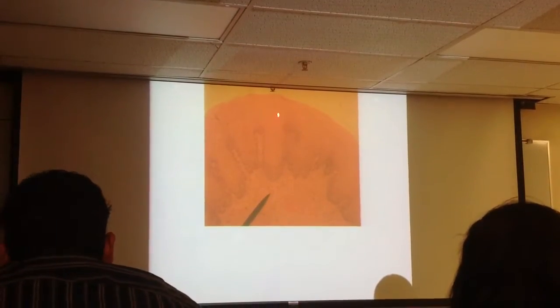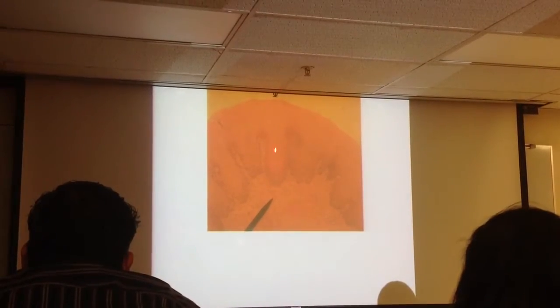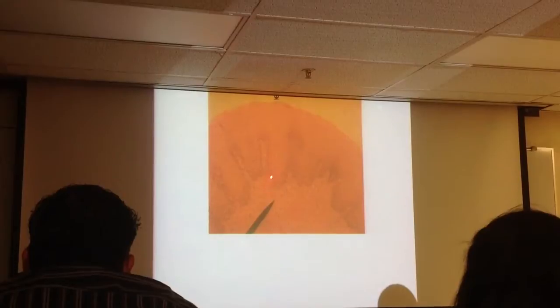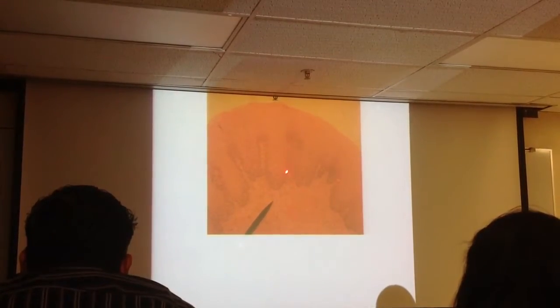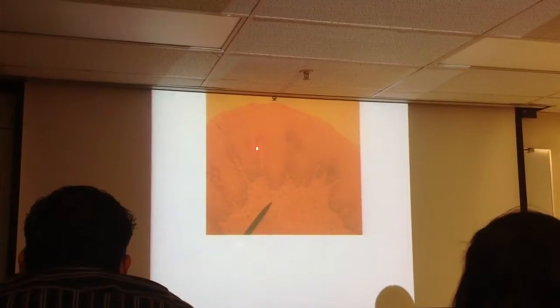Okay, so what type of tissue is all of this? Stratified squamous ET. Organ? Esophagus. What's this line down here called? Basement membrane. Broad category of tissue down here? Connective, holding all that in place.